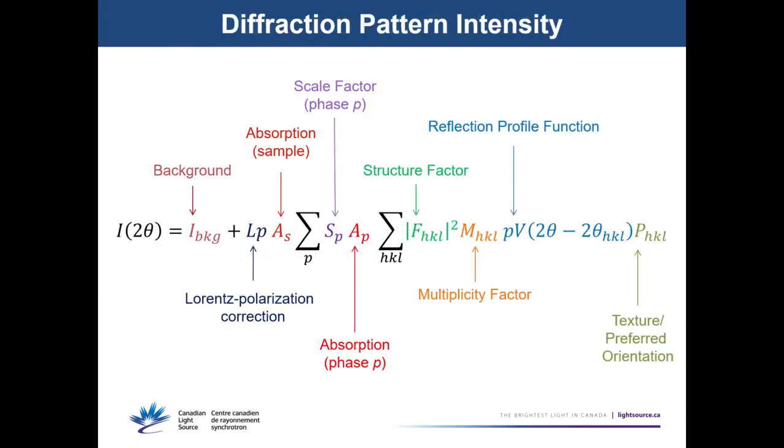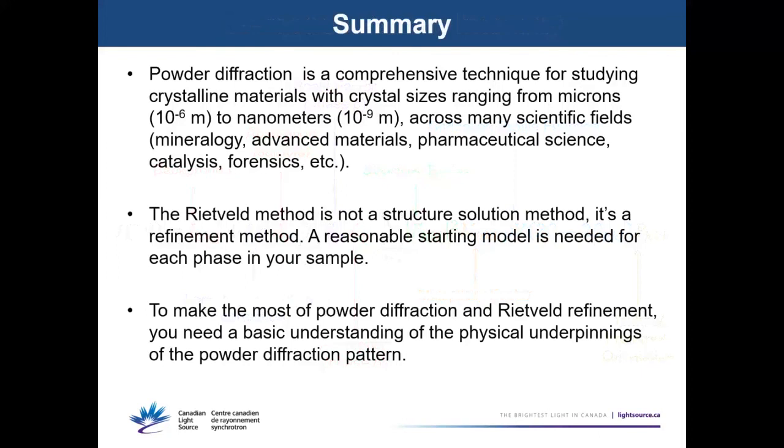So those are the factors that control the intensities in powder diffraction patterns. I'm just going to summarize quickly because we're running out of time. Hopefully this has given you a decent picture of some of the things we can do with powder diffraction and the main factors that are necessary for describing your patterns. It's important to emphasize that the Rietveld method is a refinement method. It's not a structure solution method, but tomorrow we will have a presentation dedicated to crystal structure solution and what you can do if you don't have a starting model for your material.